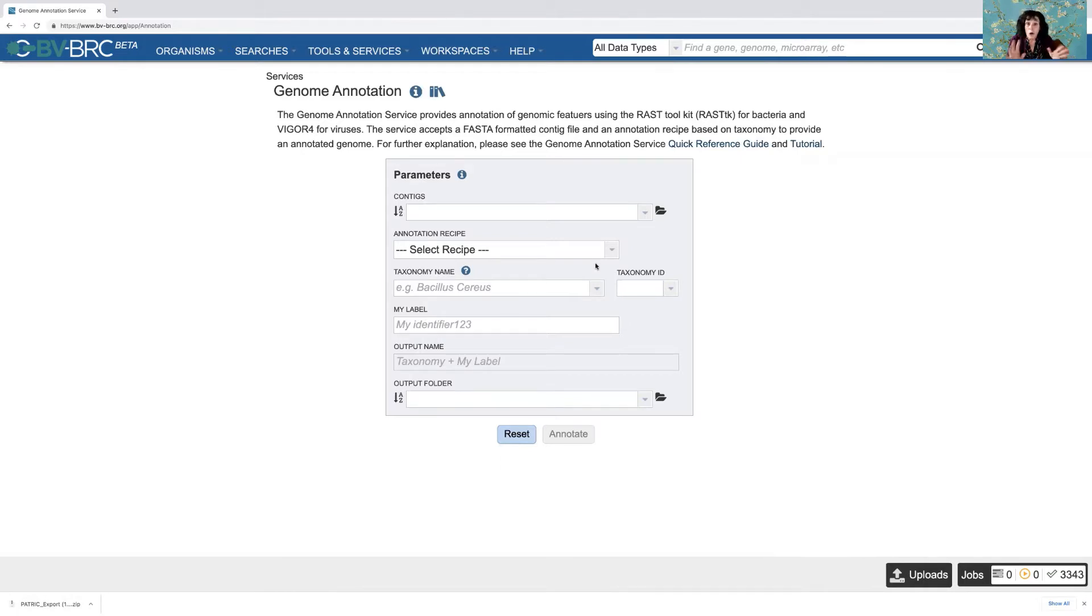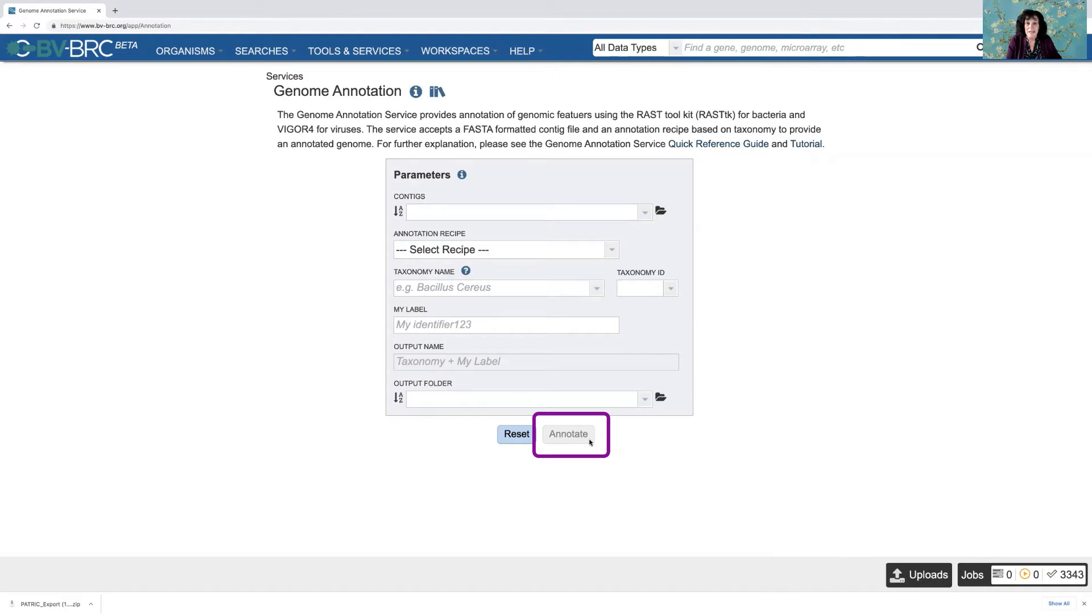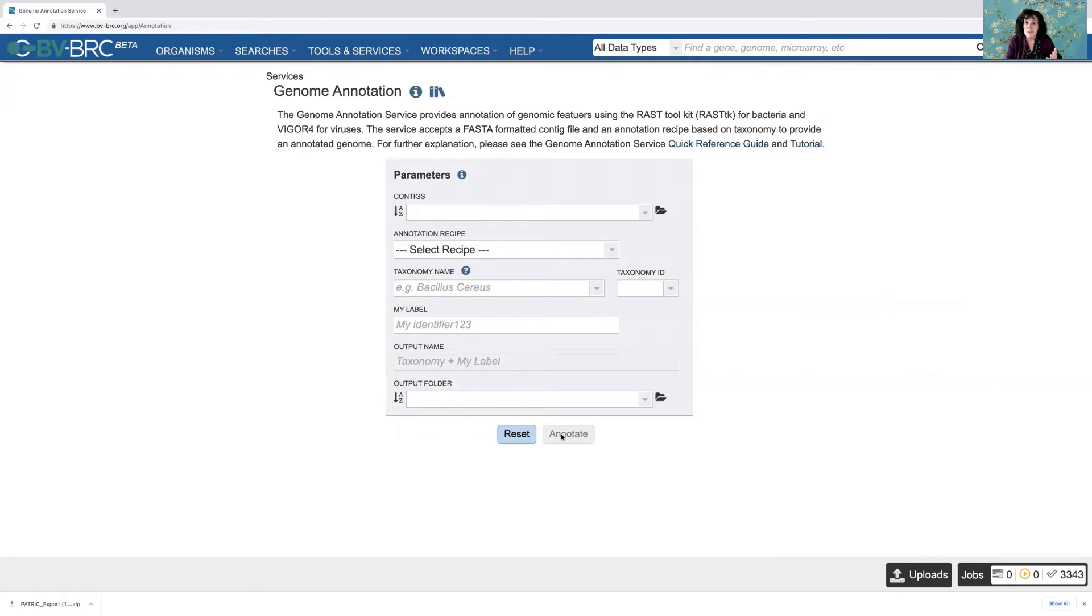And then when you do all of those things, this button that's gray at the bottom, this one, it says annotate, but in the other services it'll say something else, but they'll all be gray. But once you've completed all those tasks, then it will turn blue and you can submit your job.